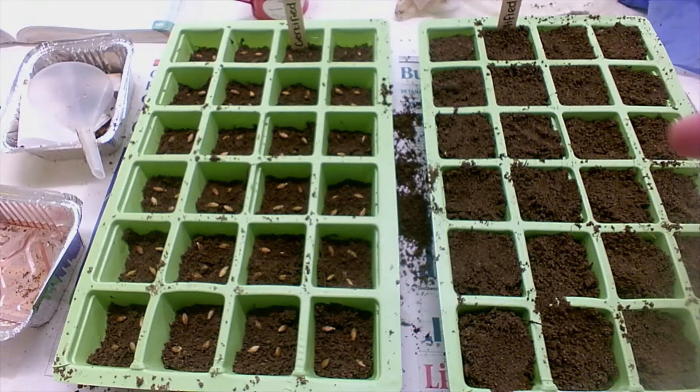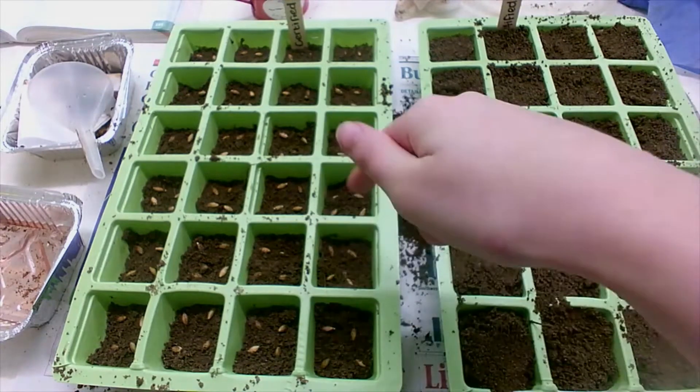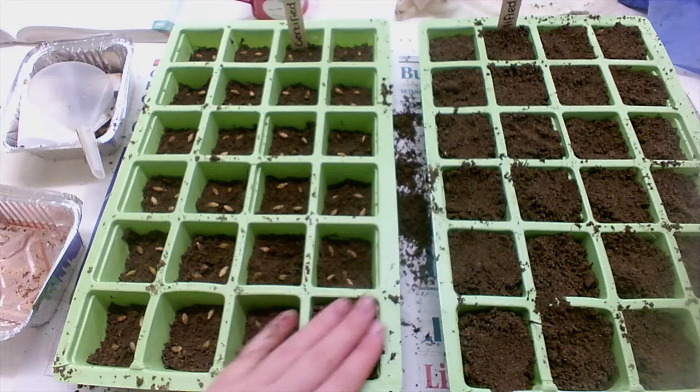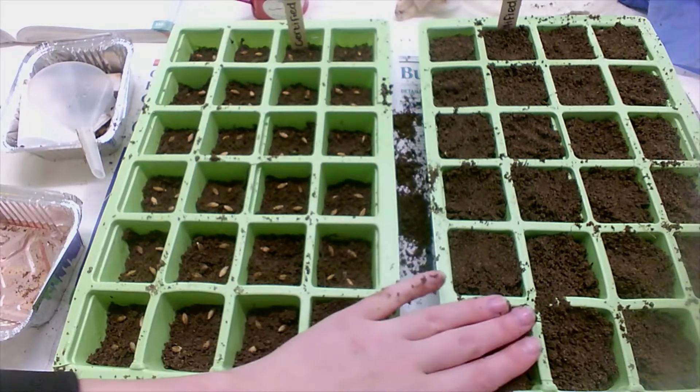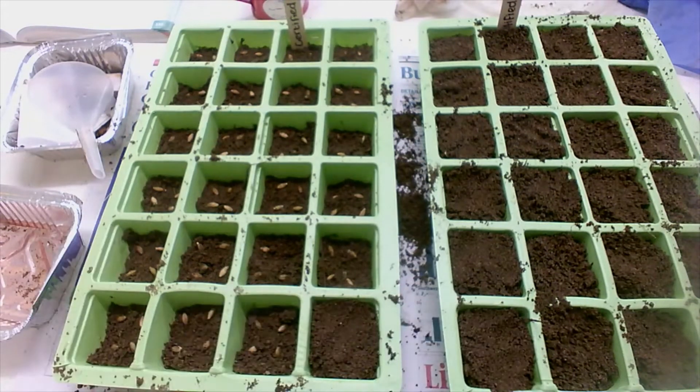So now there's four seeds in each pot as well for the certified barley seed. I'll cover each of these with three centimetres of soil and just push down to make sure that there is good seed-to-soil contact.